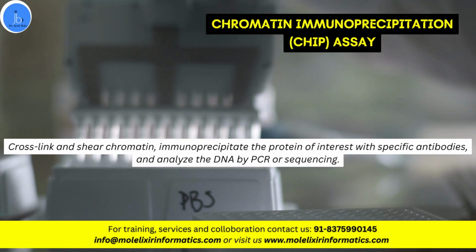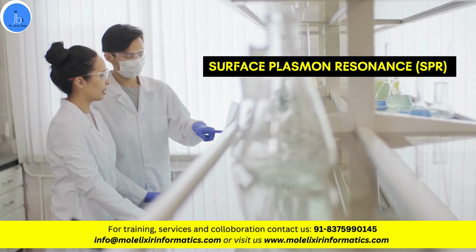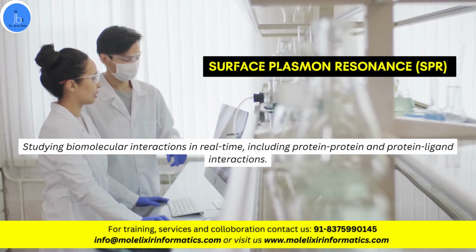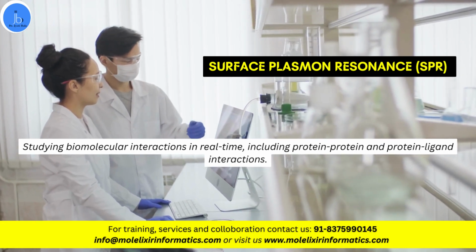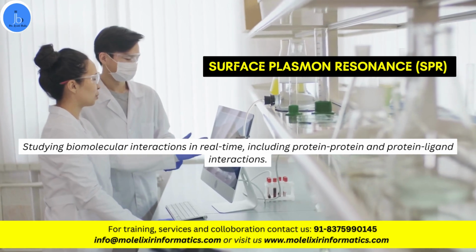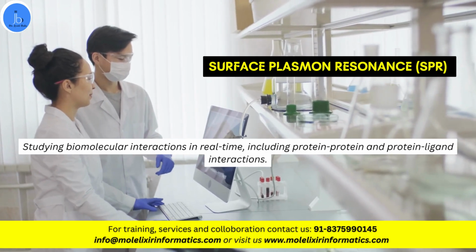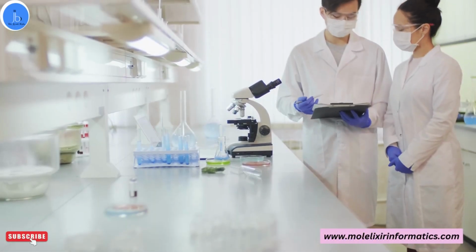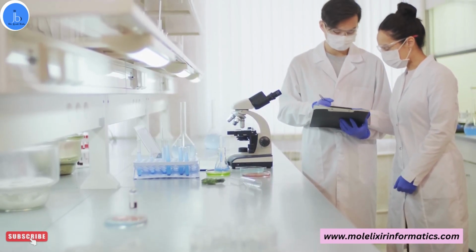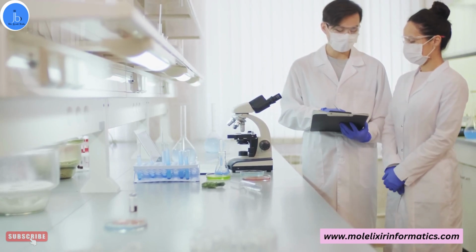The next significant technology is surface plasmon resonance, that is involved in studying the biomolecular interaction in real time, including protein-protein and protein-ligand interactions. Usually here, you need to immobilize your binding partner on the sensor surface and allow the other binding partner to flow. And thus, you can monitor the changes in the refractive index based on the binding.